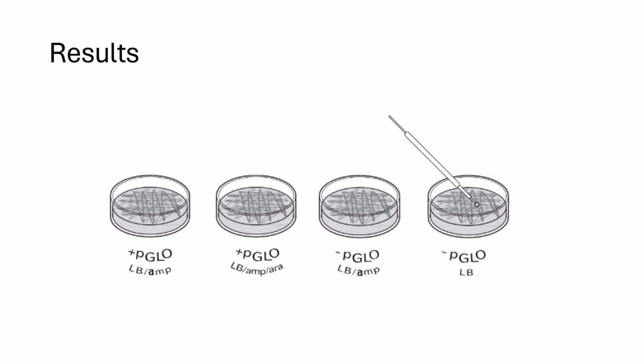You should be able to describe the control of expression of GFP most importantly. If you understand the specifics of the transformation, that's a bonus for you, but I won't necessarily highlight that in assessments.